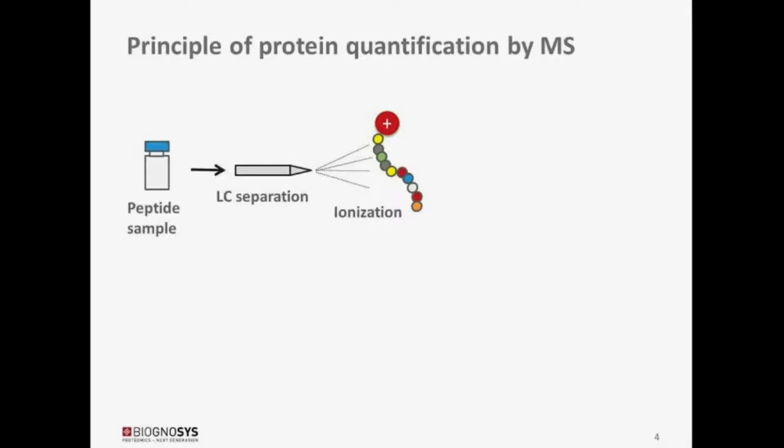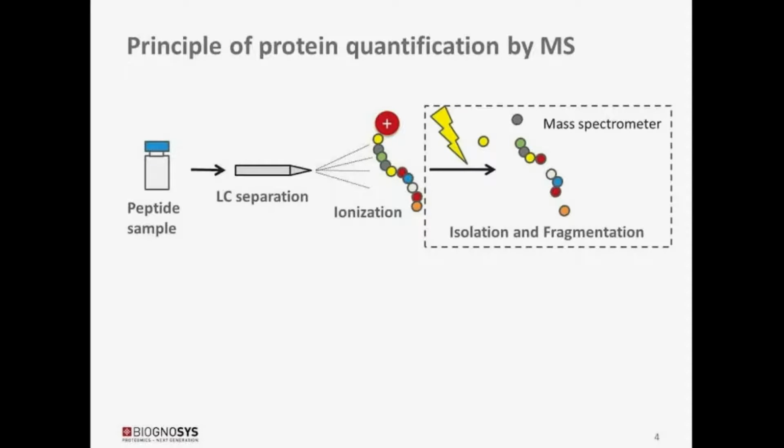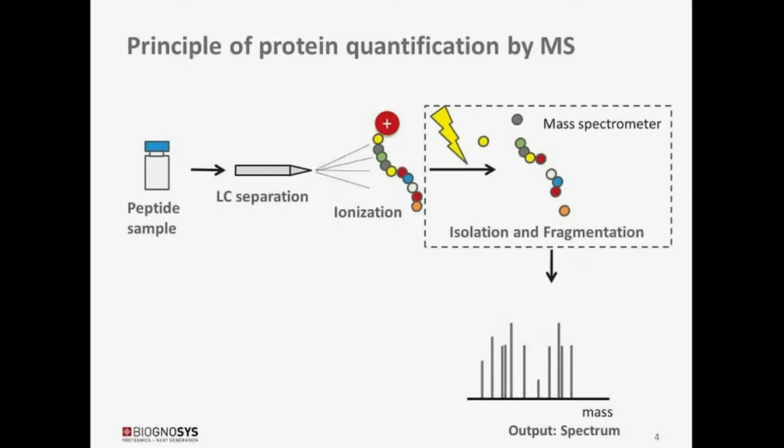Proteomics using a mass spec works in a few steps, and it starts with the peptide samples, as I described before. These are purified peptides, for instance from microtissue preparations, and they are separated over a column. It's an HPLC column, just much smaller than what is usually used in a lab. It's a nano format. As these peptides are sprayed out at the tip of the column, they are ionized and they enter the mass spec. The main thing the mass spec does is to isolate each peptide mass, or each ion at a specific mass. They are isolated, collected, and then smashed into pieces, fragmented. These pieces of several amino acids have specific masses, and what you get in the end, the real output, are spectra.